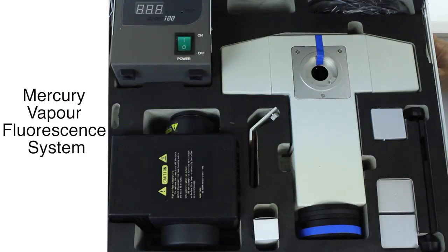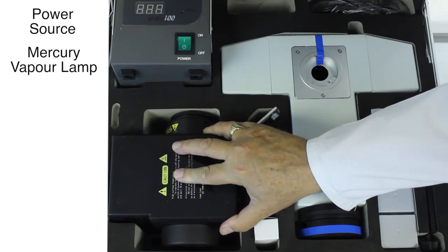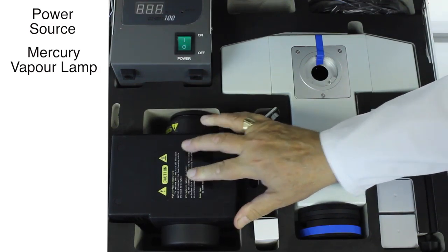In the aluminium case which you'll receive, there is the mercury vapor fluorescence system. That's the power source there. This is the housing for the mercury vapor lamp.